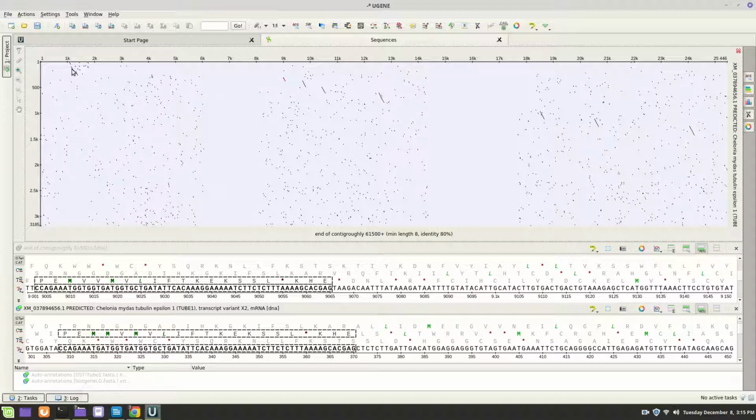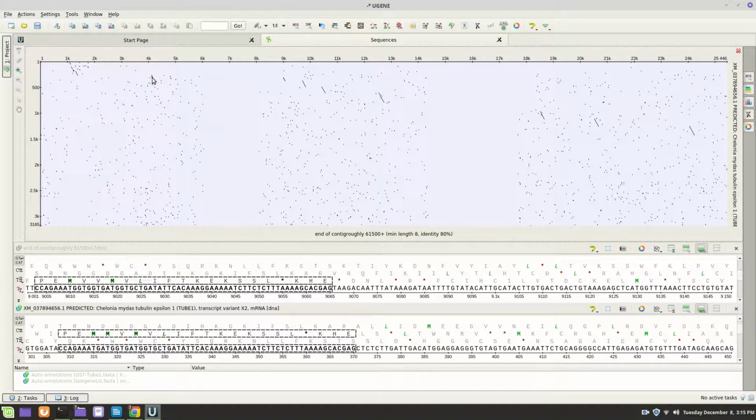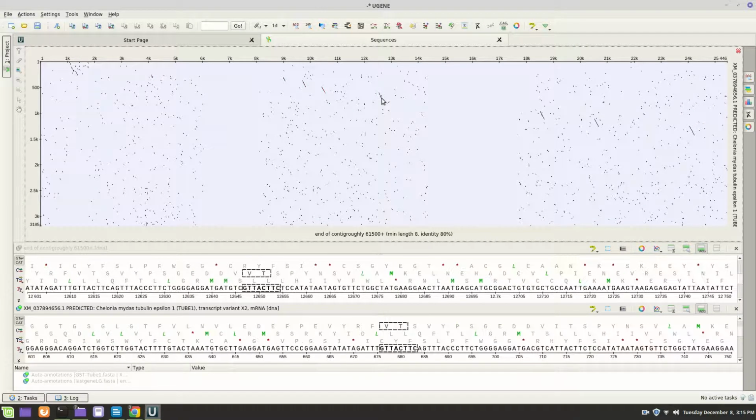Hopefully you don't have quite so much splicing in your gene. This gene has, if I remember right, 11 exons, so there's a lot of splice sites in this one. And then you kind of, is this one? You have to kind of decide that, and yes, it was. I went and looked, and there's one right there, and then here. So these are all your exons, and this is how you would do that. All right, I hope this helps. Do the best you can.